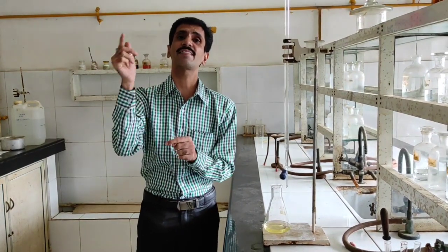Now X3 minus X2 is actually giving us the amount of NaOH which corresponds to aspirin. So using these values, we can find out the percentage purity of aspirin. So I hope you have understood this experiment very well.